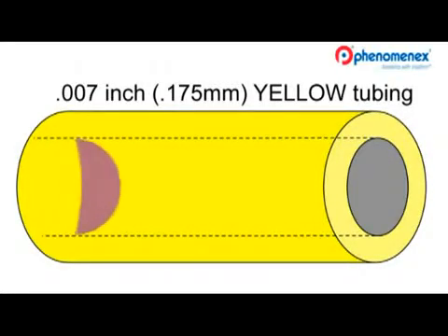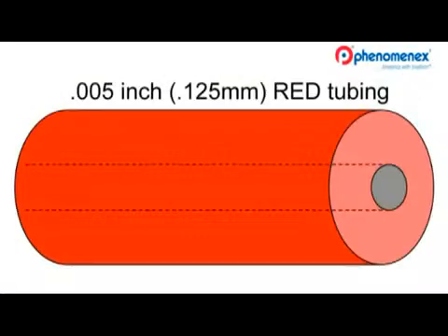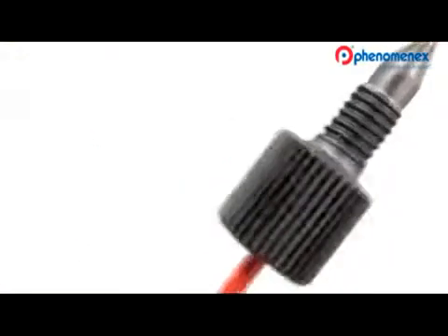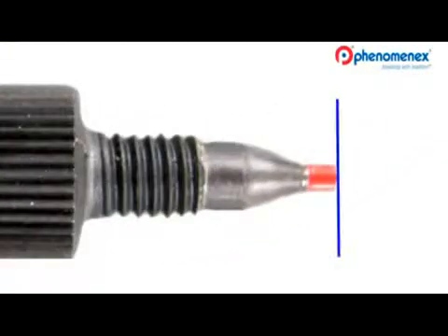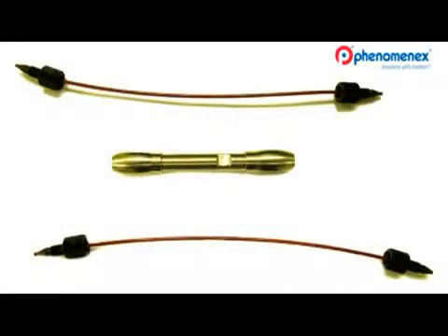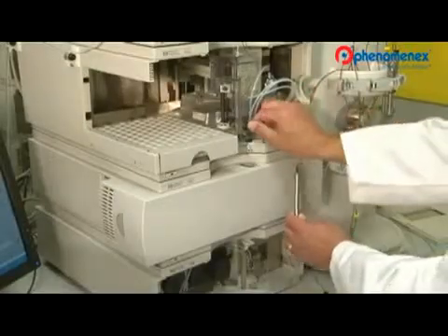Small volume peaks in this tubing may dilute and become dispersed. The smaller diameter red tubing has a solvent volume of 0.13 microliters per centimeter and can maintain peak integrity. Replace the conventional fitting with PhenomenX high-performance finger-tight fittings. Please make a good square cut — bad cuts are a common cause of efficiency loss.